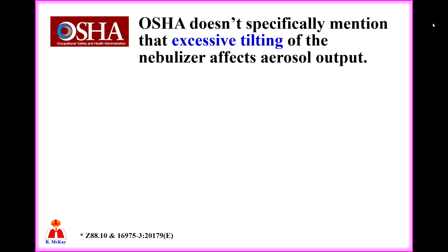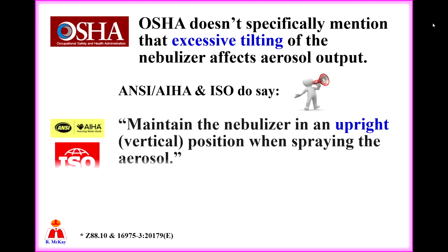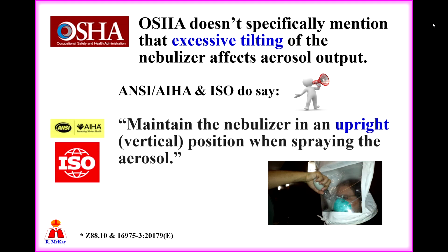So, another source of human error is excessive tilting of the nebulizer. OSHA doesn't specifically mention that excessive tilting of the nebulizer affects aerosol output. ANSI and ISO do, and they say, quote, maintain the nebulizer in an upright, vertical position when spraying the aerosol. You'll notice the picture at the bottom right where the operator certainly is not holding and spraying the nebulizer in an upright, vertical position. In this example, no liquid aerosol will be generated.